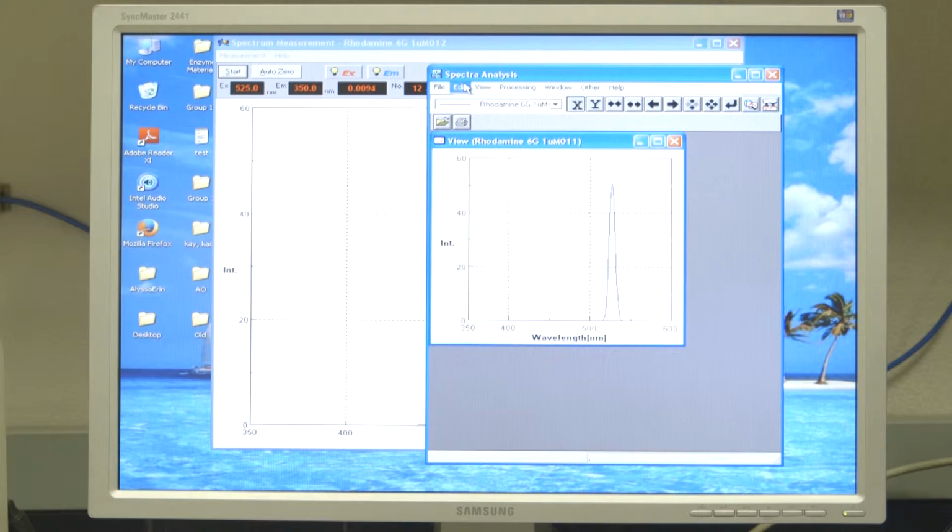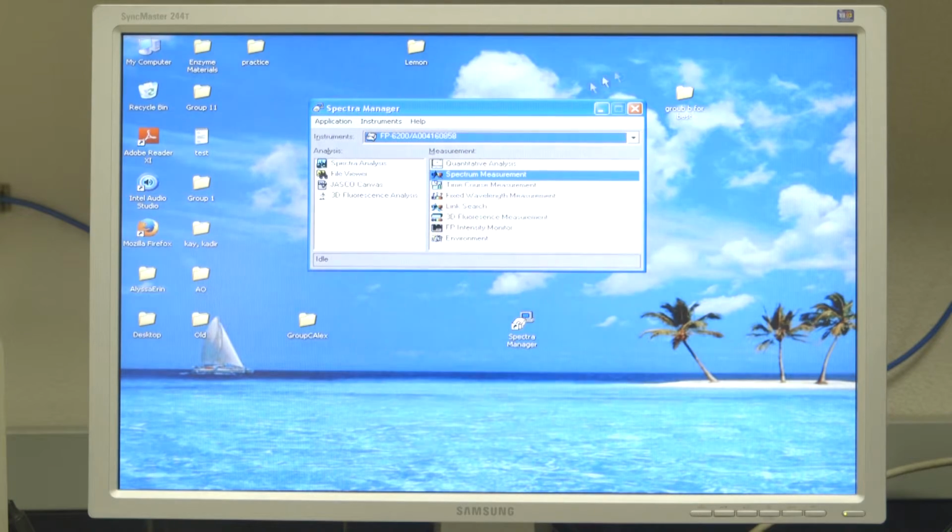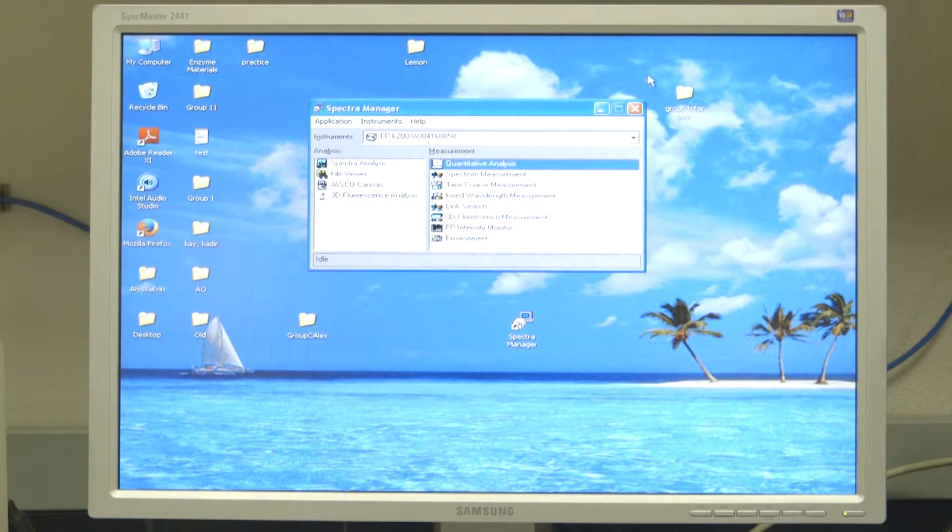I think that's it for this window, really. I mean, you could, actually, that's not how you zoom in. Yeah, it's pretty straightforward. Okay. And that's all for that one.